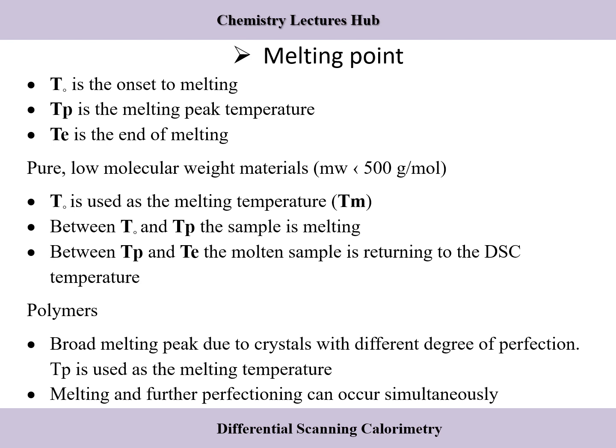For example, it is used for compound characterization as well as purity evaluation in organic chemistry, and also as a descriptor for the prediction of solubility, a key determinant of the bioavailability and in vivo activity of a candidate drug.